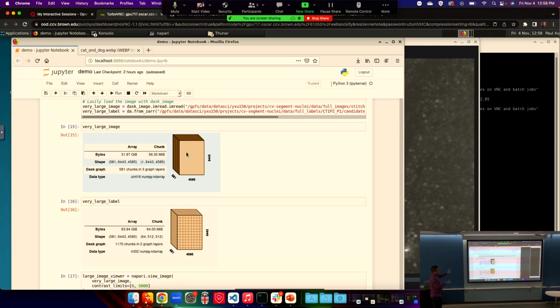But again, with only 7 gigs, I was very afraid that at some point it would go over the memory limit, so that's why I tried not to do that. But there are definitely ways that you can get around that limitation. Yeah.